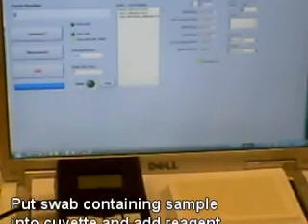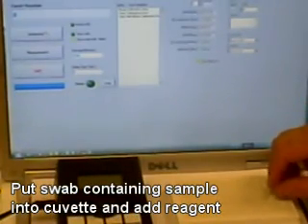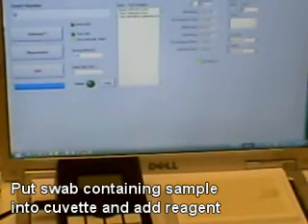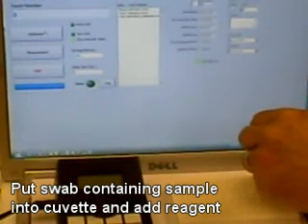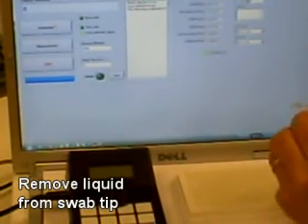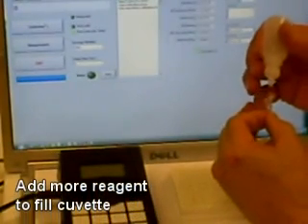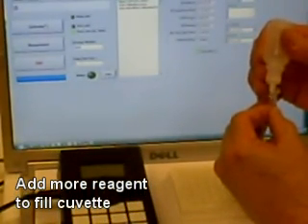Now that the calibrations have been done, you are ready to assay your swab sample for the presence of microorganisms. First, add a clean cuvette to a holder. Place your swab with the sample into the cuvette. Add four drops of the reagent supplied into the cuvette containing the swab sample. Now you will wait ten minutes. After the ten minutes, wring out the swab by pressing the swab tip against the side of the cuvette as you're pulling it out and discard the swab.